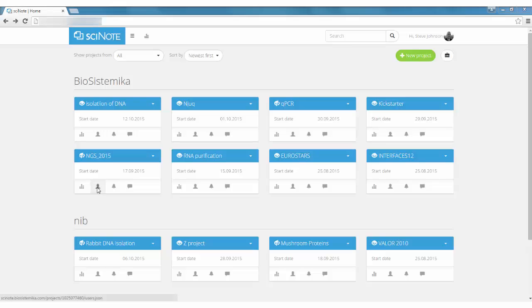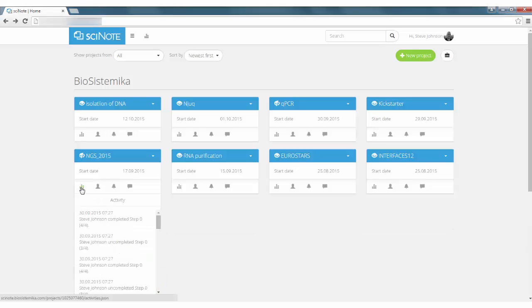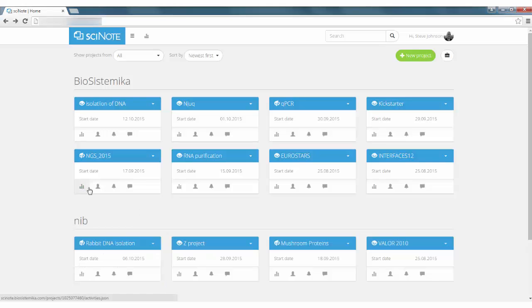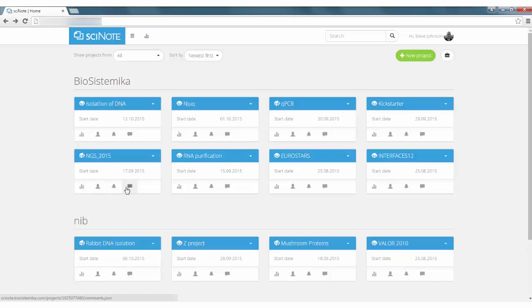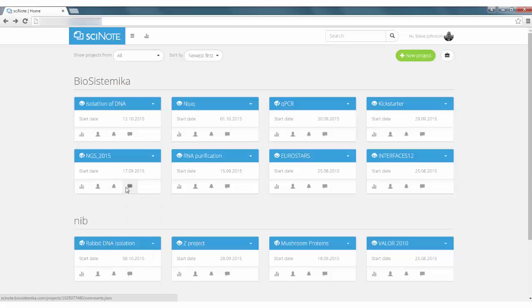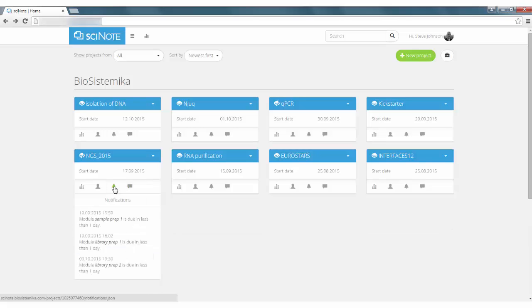Dashboard offers a quick way to review the latest activity on a project, write comments and see upcoming deadlines.